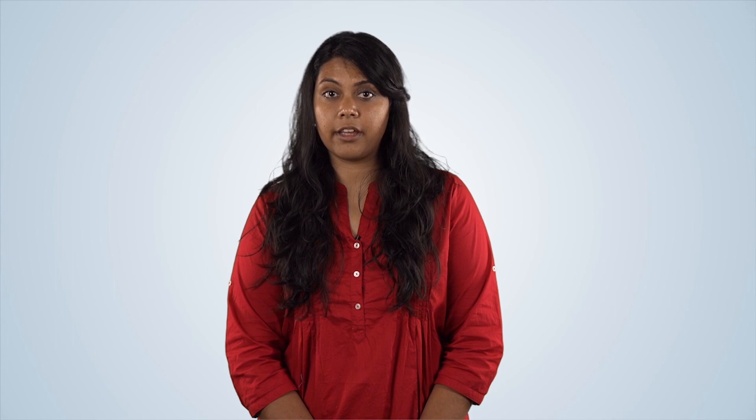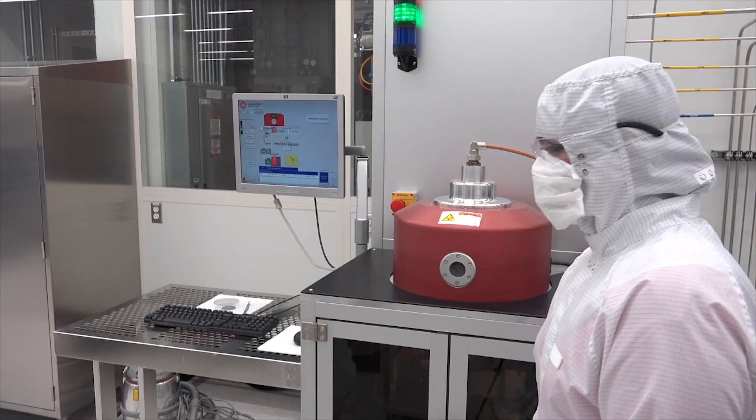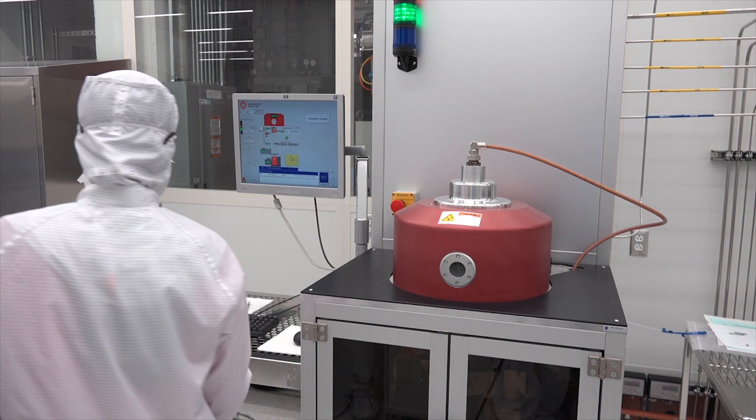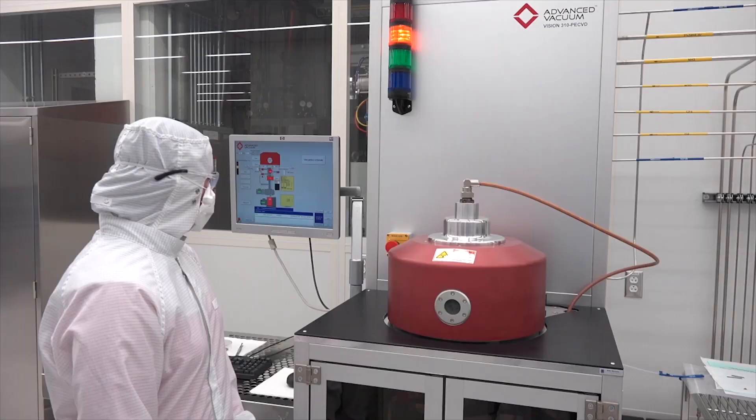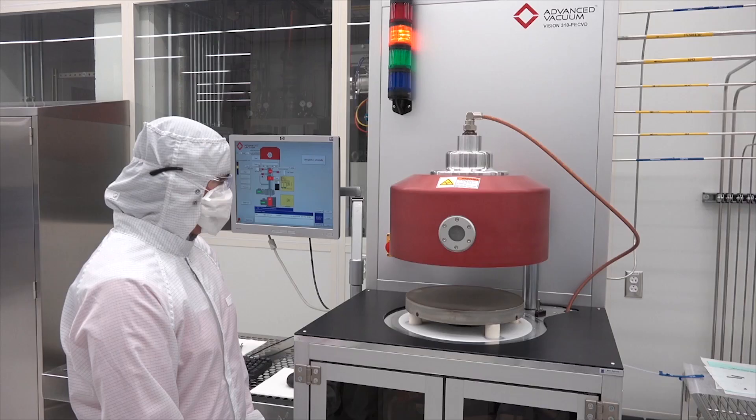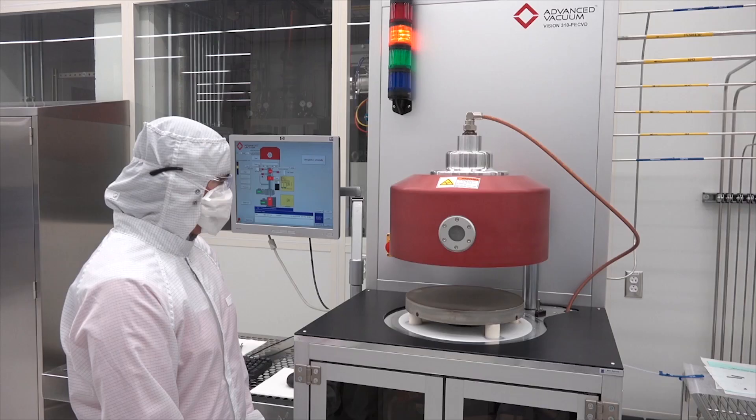Since the chamber is under vacuum right now, my first step is to vent the chamber. This means that we flow nitrogen into the chamber until it reaches atmospheric pressure, which is the pressure in the room. And then, the red chamber dome will automatically lift and rotate to the side.